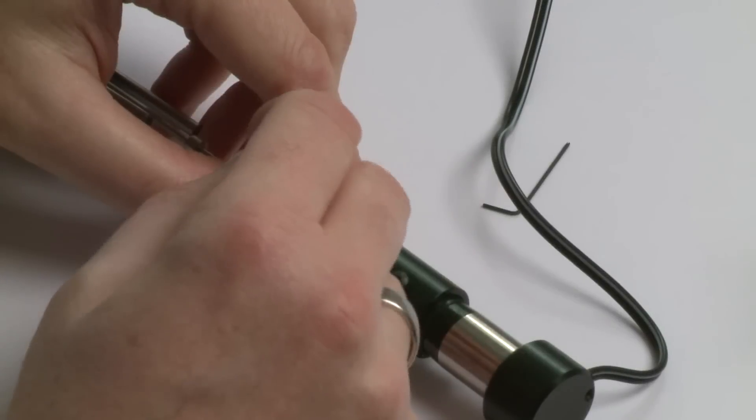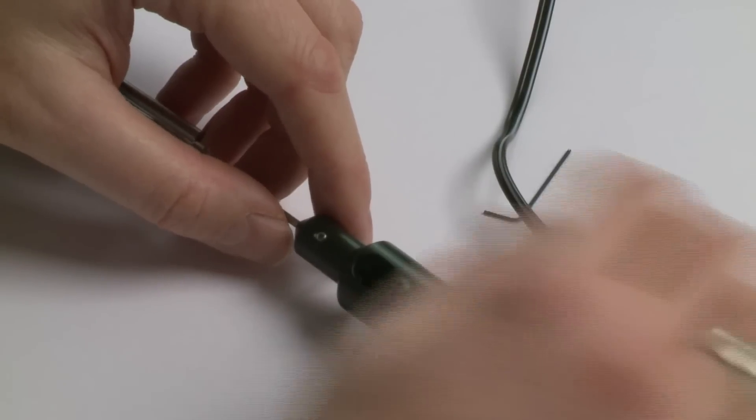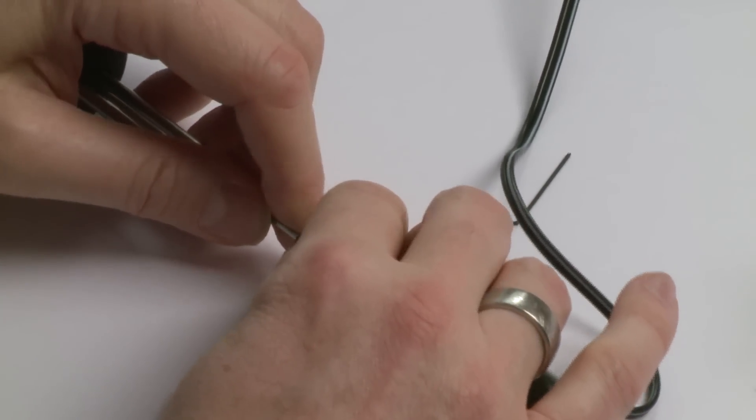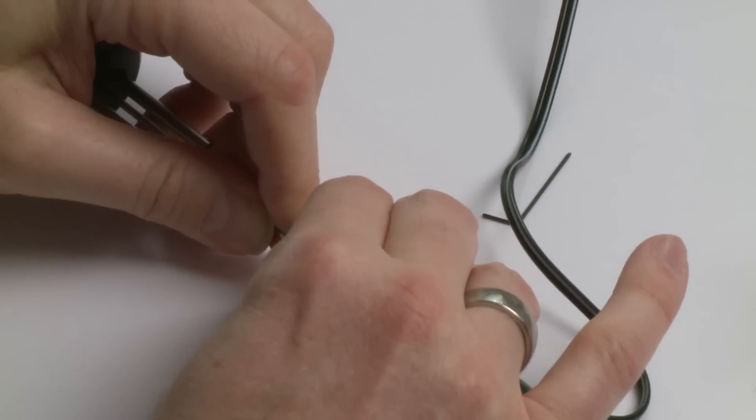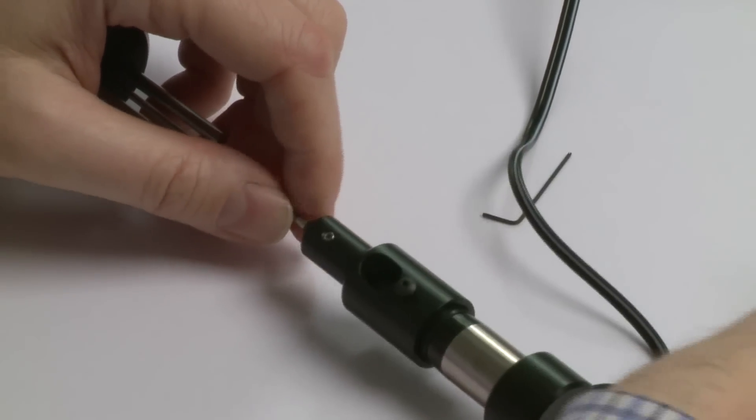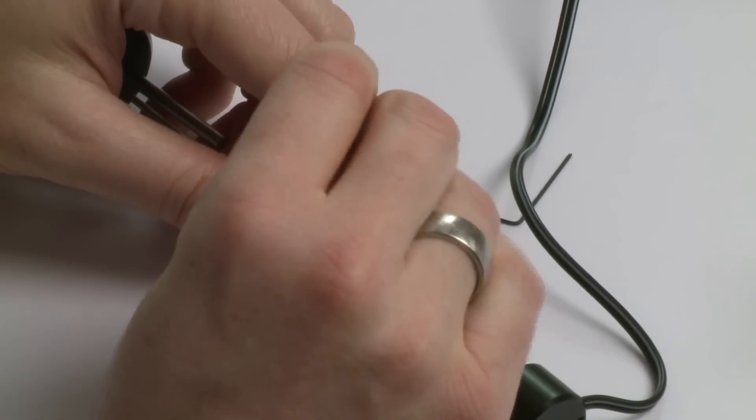And you have two screws, one on each side, and then you have to move the holder down a bit and refasten.